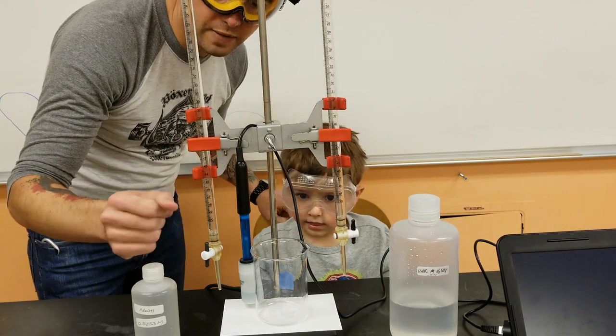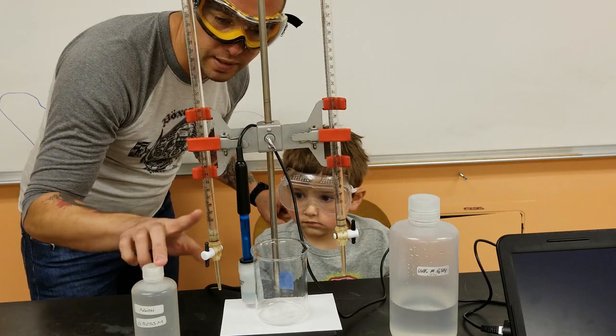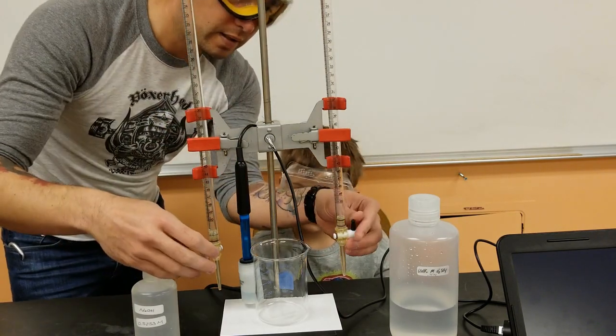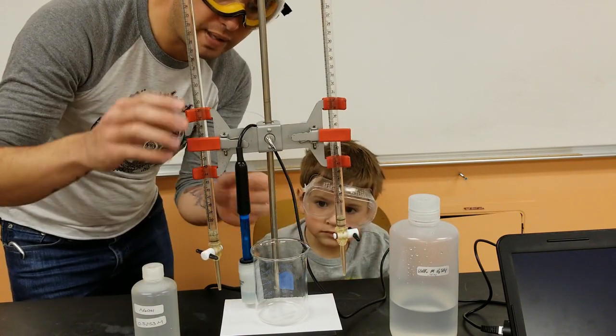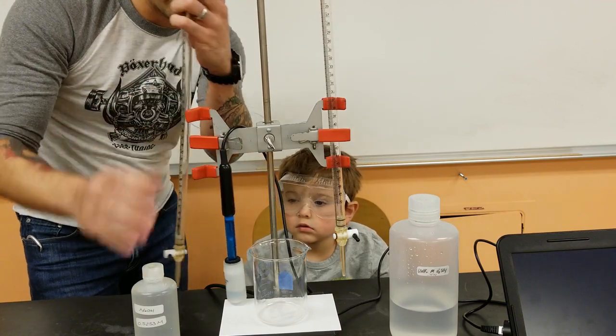So we're going to start off this experiment by conditioning the 2 burettes. This one will have the base and this one will have the acid. Again, conditioning makes sure that no matter what was in these before, it's all flushed out.